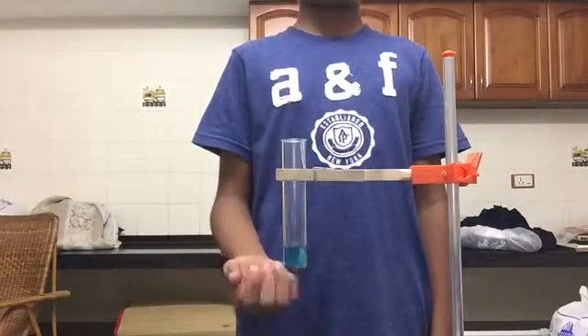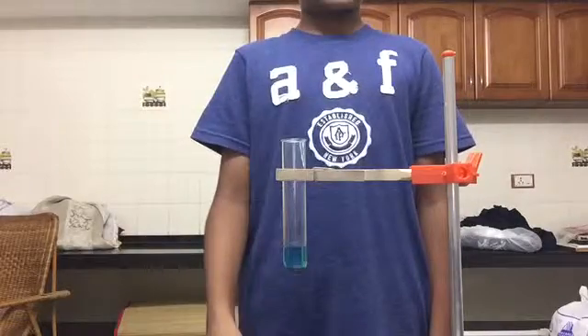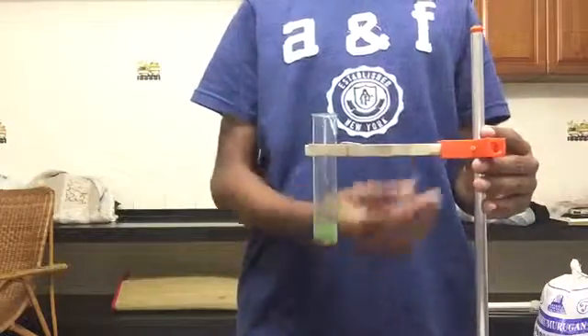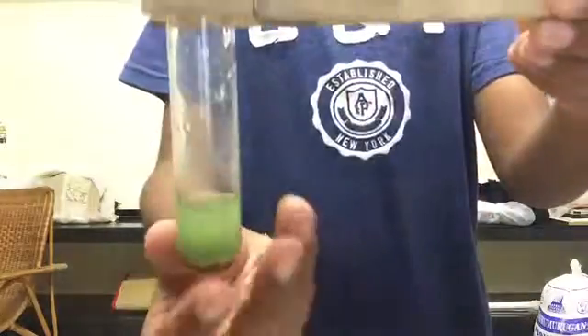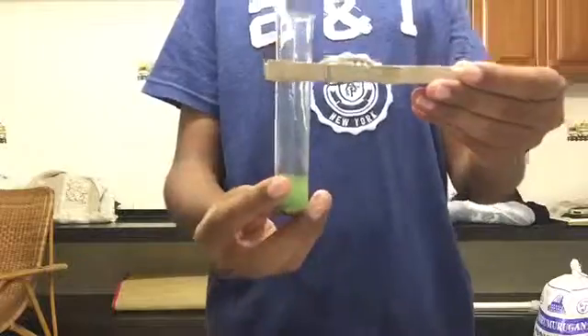As you can see, the iron sinks to the bottom. We're going to wait for some time and observe the solution later. This is how the solution looks after a period of ten minutes. You can see that the copper has been displaced — the brown solid at the bottom is copper.